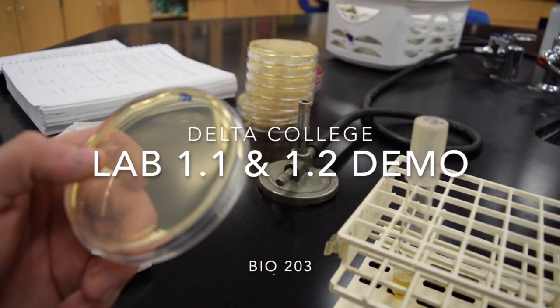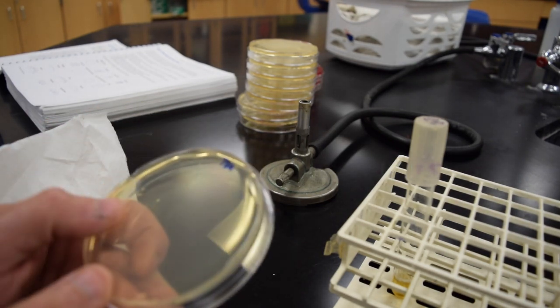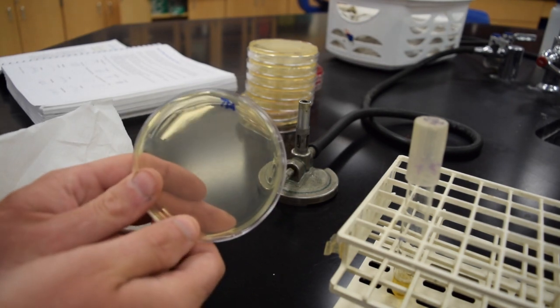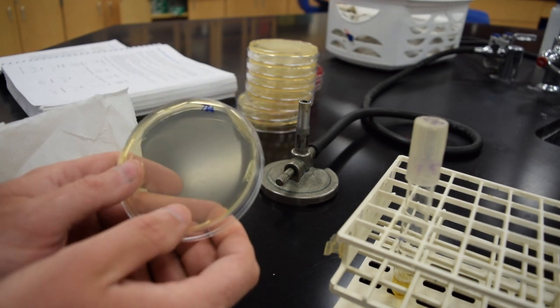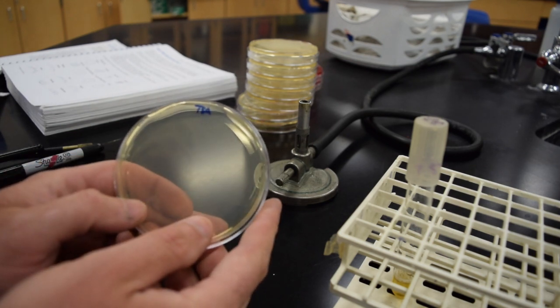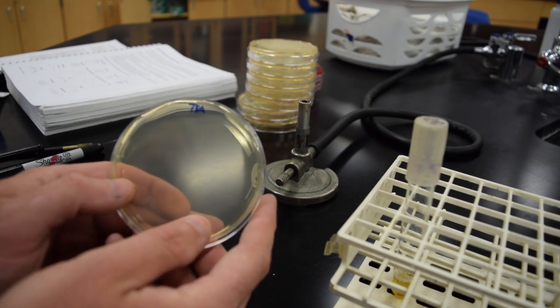This is a little demonstration video for the hand-washing activity, which is in Lab 1.1 in your textbook. This is TSA media — tryptone soy agar. Tryptone soy agar has agar in it, which is a solidifying agent, so it's kind of like making jello. It comes in a powder form and you put it in liquid, heat it up, sterilize it, and when it comes to room temperature the agar solidifies.